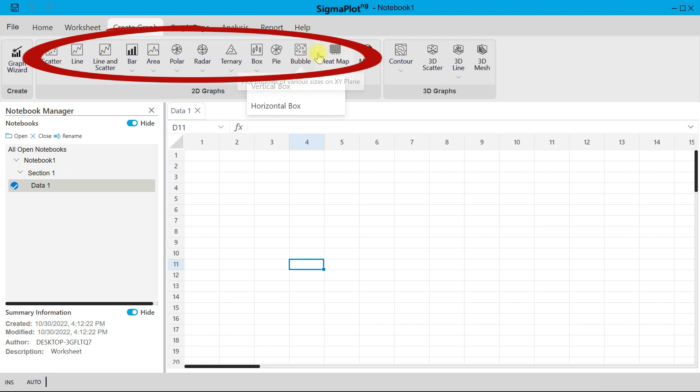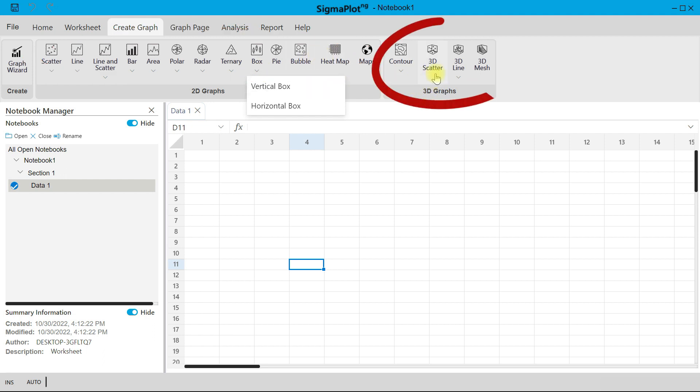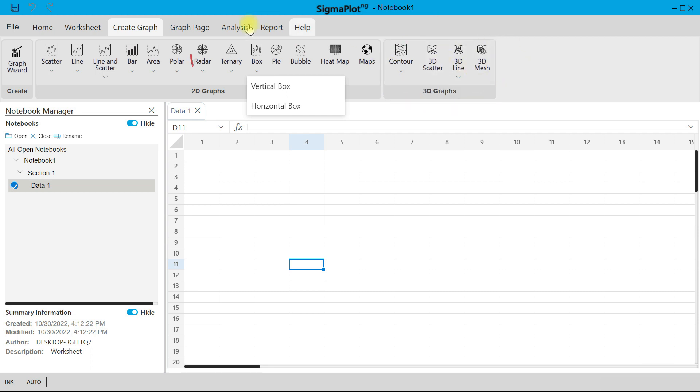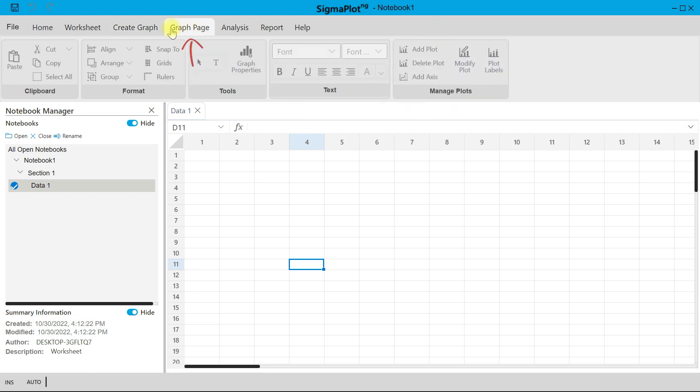And then you can also come to your 3D plot area and choose 3D graphs: 3D Scatter, Contour, Line, Mesh Plot. And then once you plot a graph page opens, you can also use this tab to help edit the graph page.